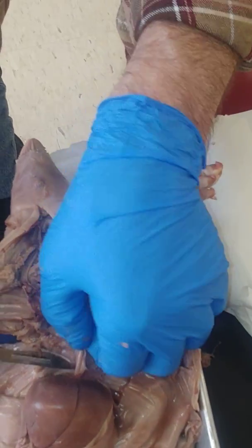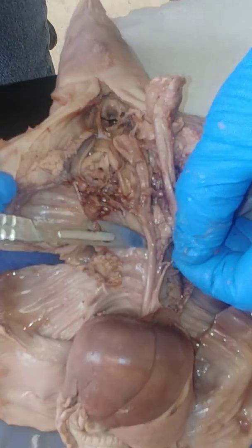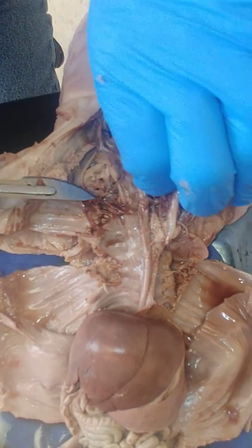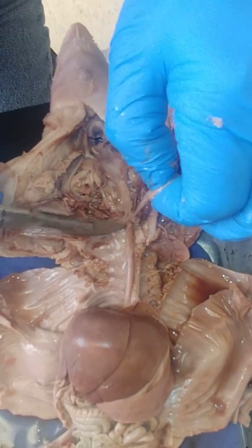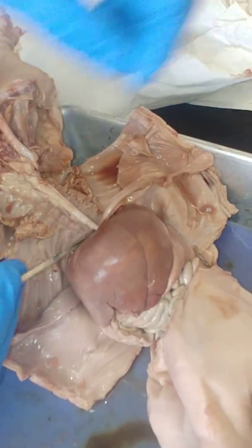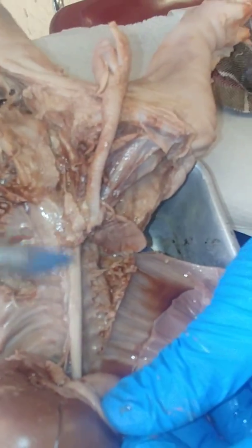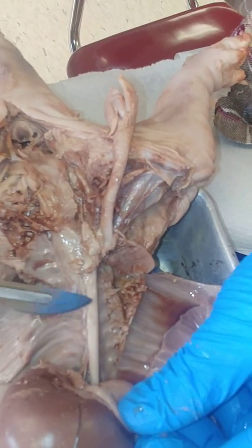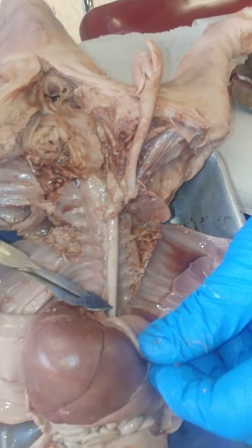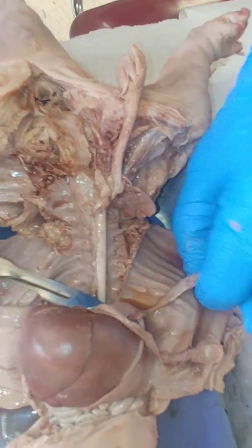Okay, so I mentioned this earlier, this little tube here, this is the esophagus. And right underneath that, you've got this really thick white line right here. This was the aorta. This was that large blood vessel hooked up to the heart. So they call this the descending aorta, descending down into the lower part of the body. And once again, you had the diaphragm that was across there.